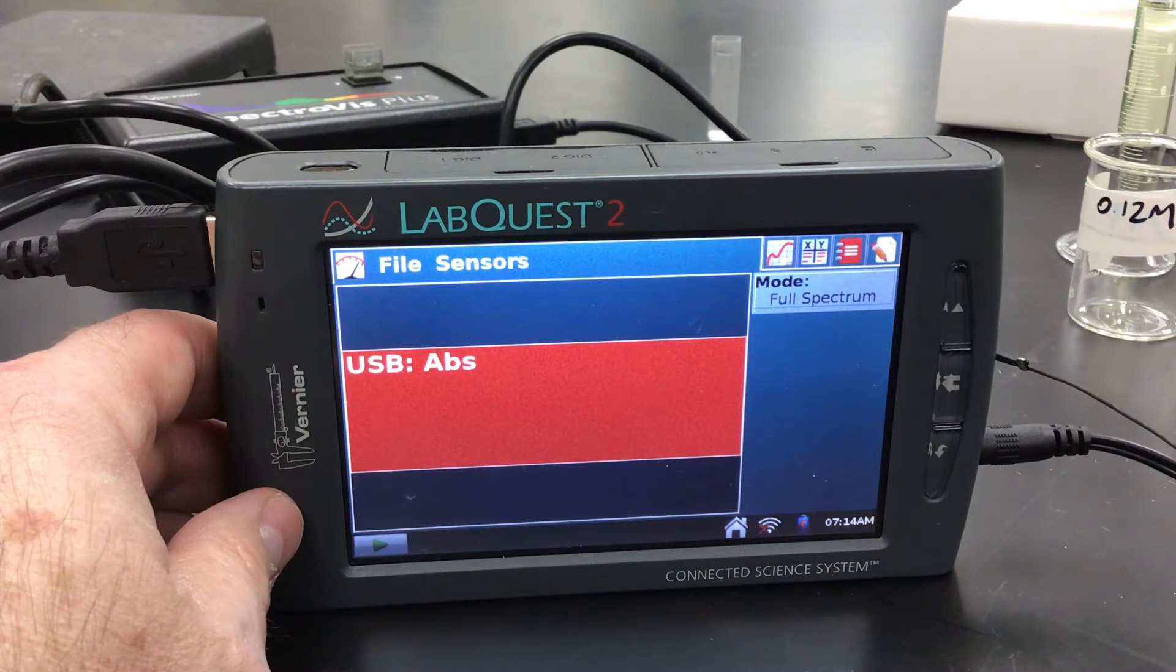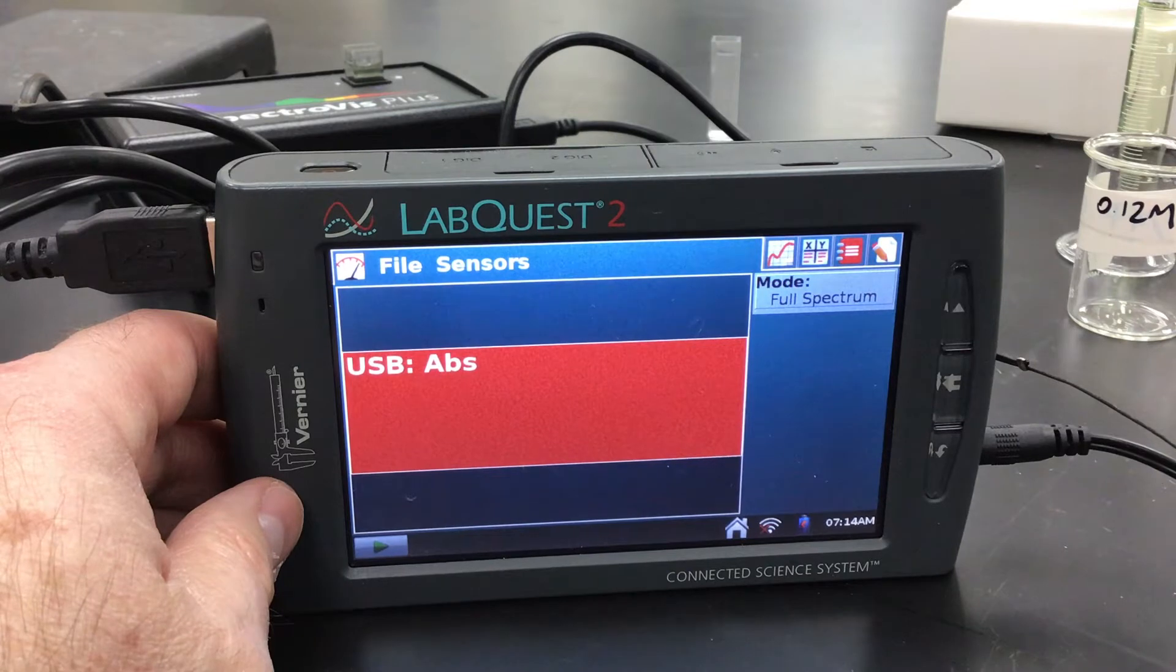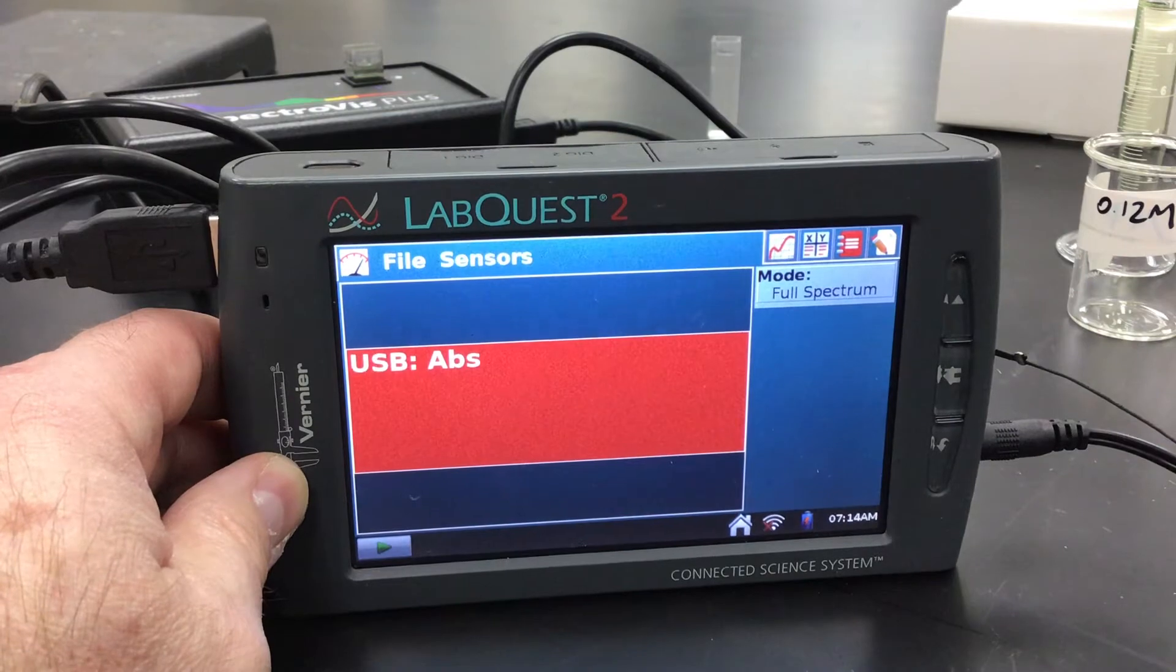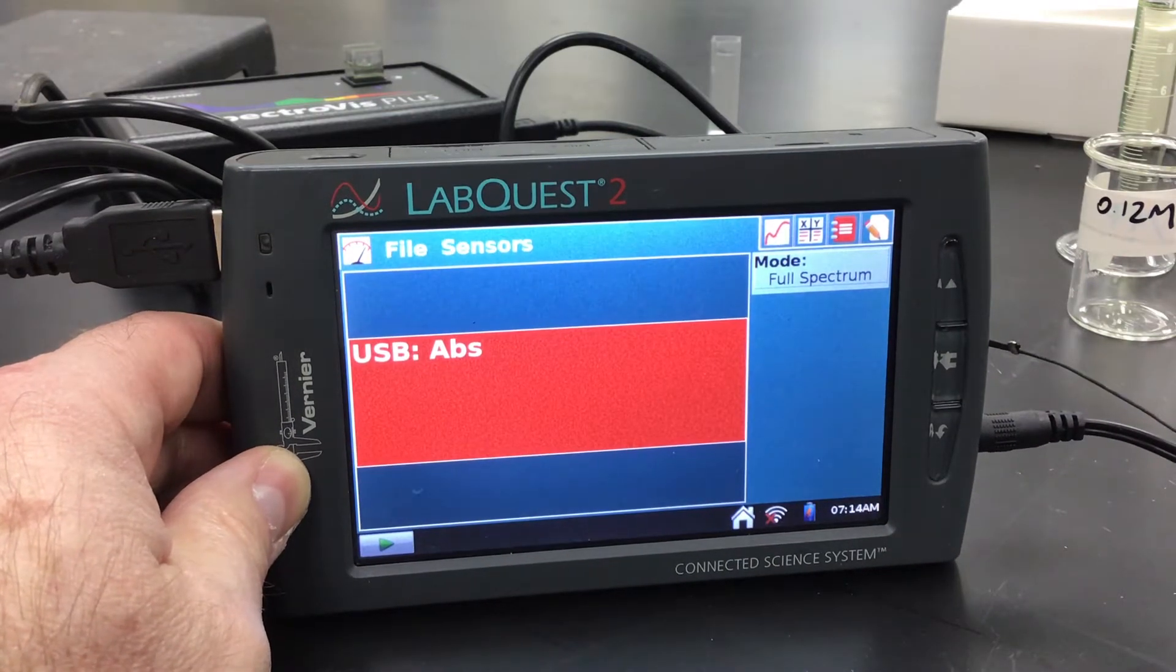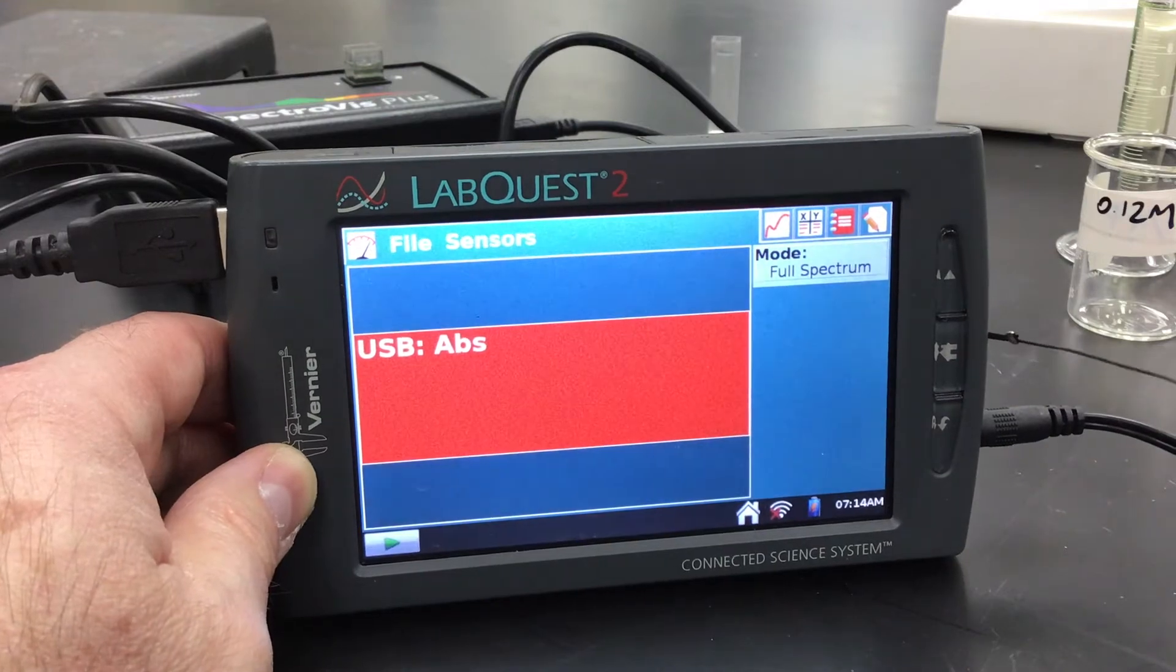So far, I have calibrated my spectra viz with a water blank. And next, what we're going to do is set our wavelength. Just so that we have something in there as far as solution-wise, I put my iron solution in the spectra viz.